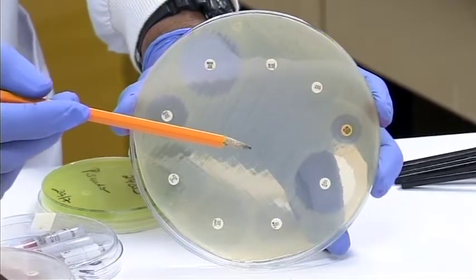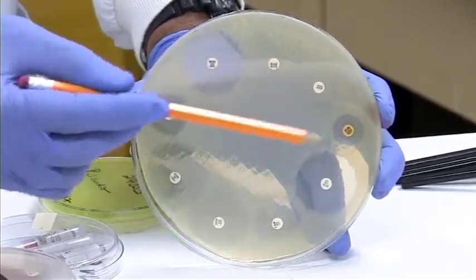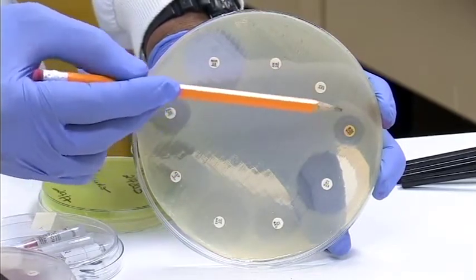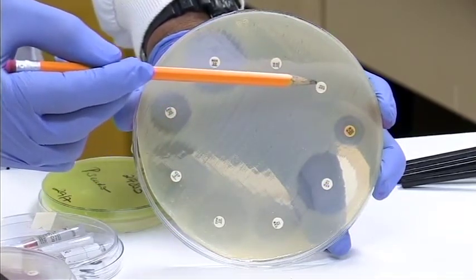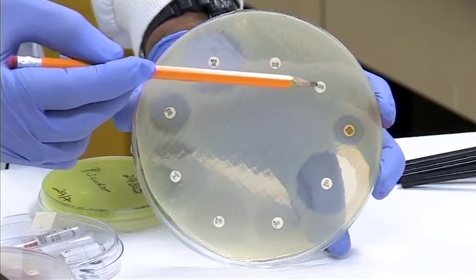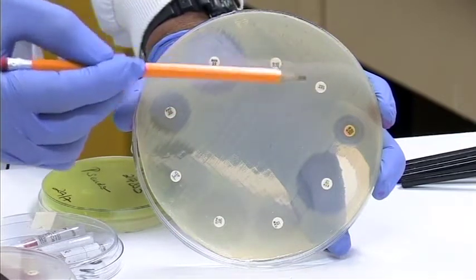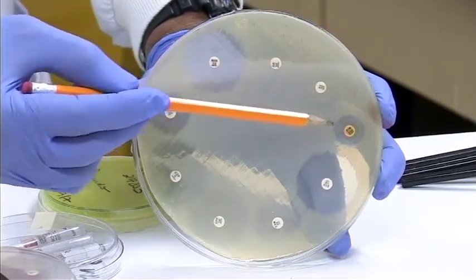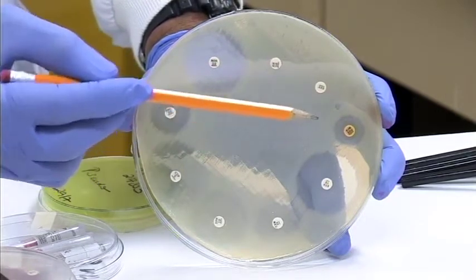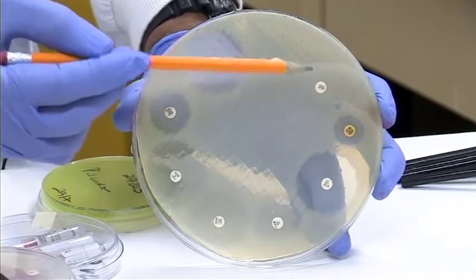So here we have another antibiotic sensitivity testing plate where we have different antibiotics. Here we have an antibiotic where there's a zone size. Here there's an antibiotic disc without a zone. What would have happened here is that because this drug was ineffective, the bacteria grew all the way up to the disc and there's no zone of clearing, whilst in this case here, the bacteria grew up to a certain point and the drug would have killed it in a circular fashion. So we have zones of inhibition here, no zone here.